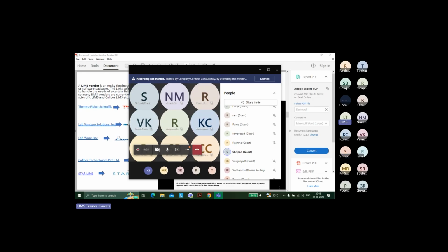That's why in LabWare LIMS the subroutine comes, and in LabVantage your Java code comes. In LabWare LIMS we have the Crystal report. So one thing is that I'm giving you one software. The other thing is that I need to look into the technology also, so that I can modify it or customize it a bit as per my needs, right? Agreed. Okay.